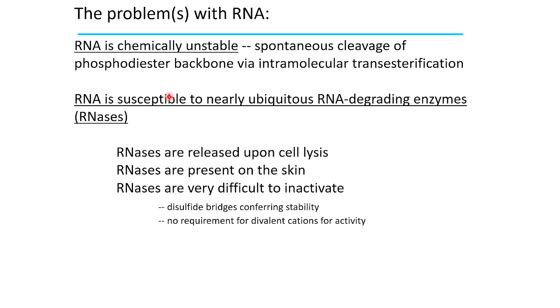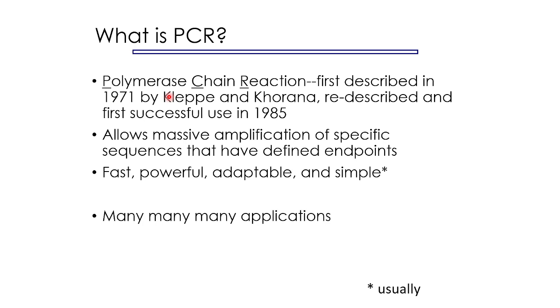So because of this, RNases are very stable, and we find it very difficult to inactivate them. These RNases are the RNA degrading enzymes. So these are a few problems which we basically face with RNA.